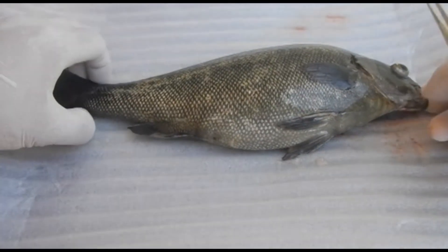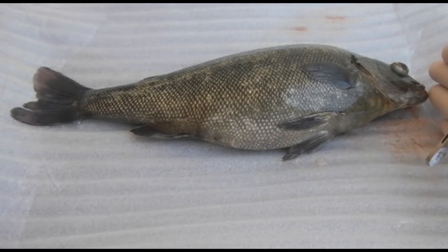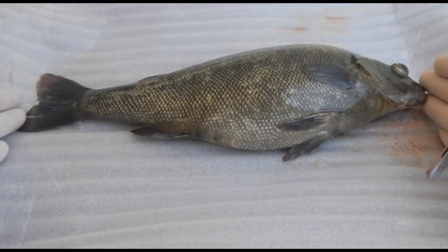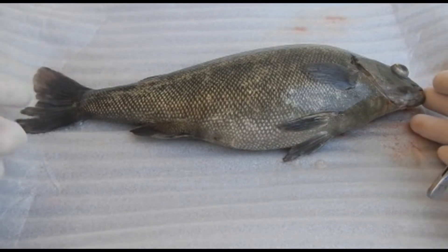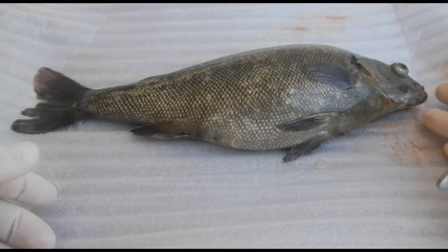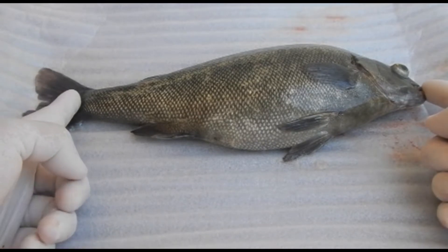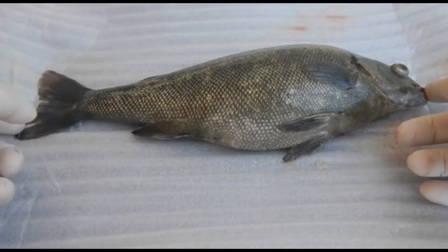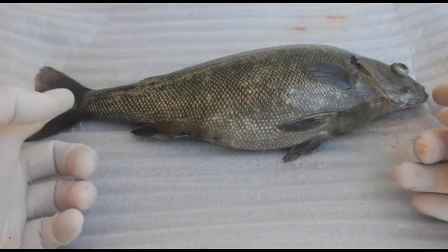Fish are given three different types of lengths that you can measure. The first is the total length, which is a measure from the tip of the mouth to the tip of the tail. The fork length is from the tip of the mouth to where the fork is in the tail. And the third way of measuring is the standard length, which is from the tip of the mouth to the caudal peduncle right here.